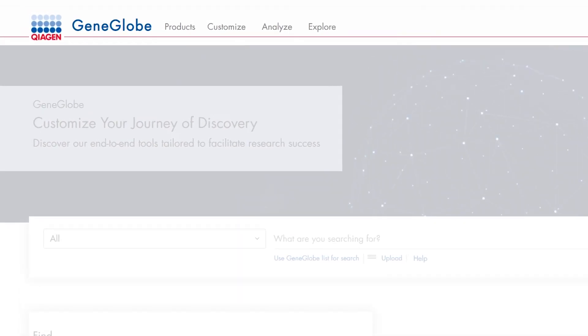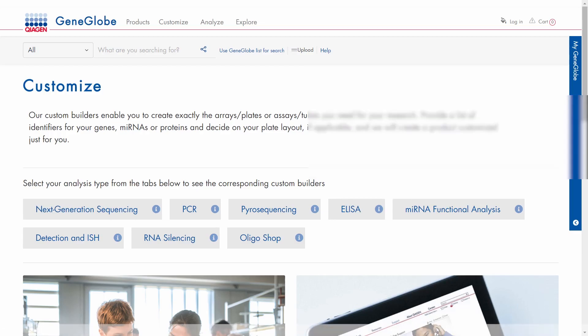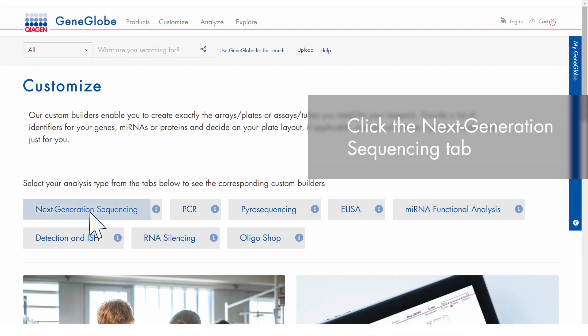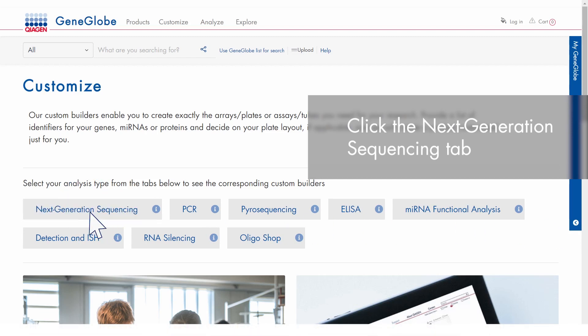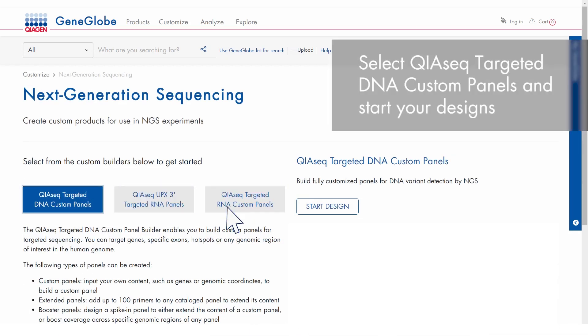You can access the custom builders directly from the GeneGlobe navigation. Click the Next Generation Sequencing tab to see the available custom builders, then select QIAseq Targeted DNA Custom Panels and start your design.